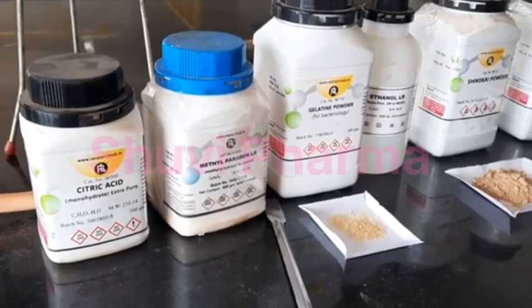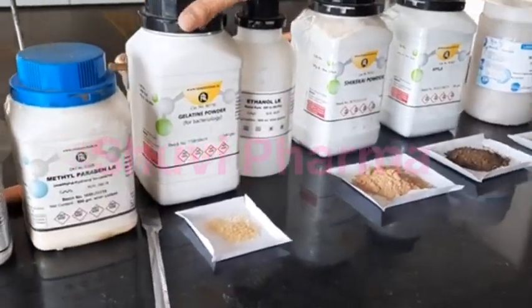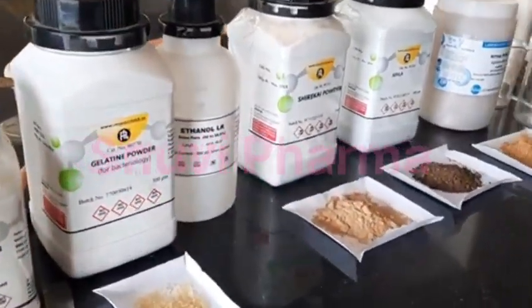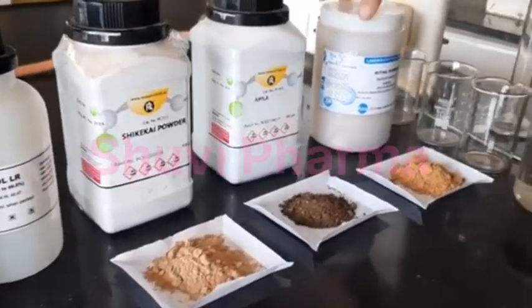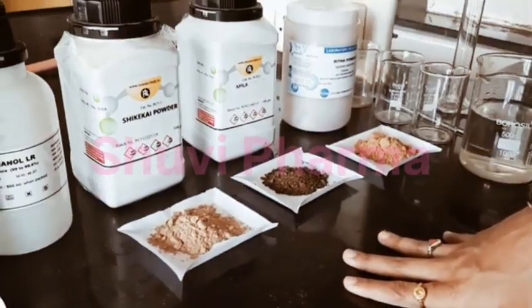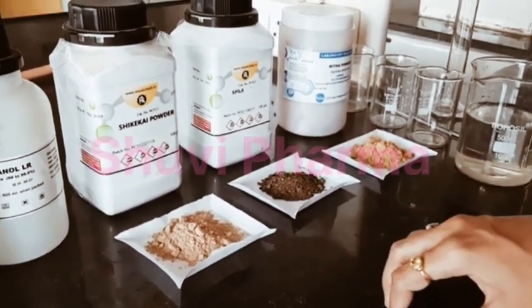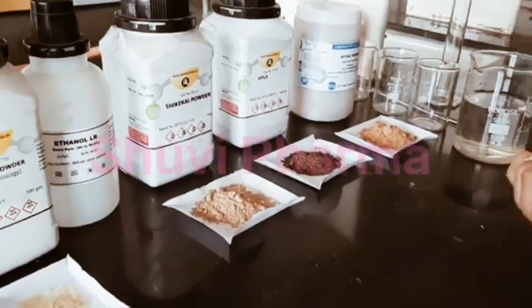So here are the requirements for herbal shampoo preparation, that is citric acid, methyl paraben, gelatin powder, as we require gelatin solution, ethanol, shikakai powder, amla powder and Reetha powder. I have already weighed the quantities, and now we will prepare the extract of shikakai, amla and Reetha, and with that we will prepare the gelatin solution. So further we can proceed for the preparation of shampoo.